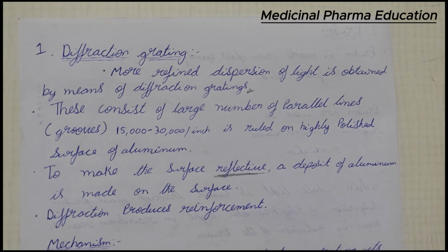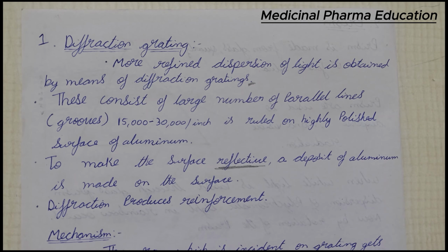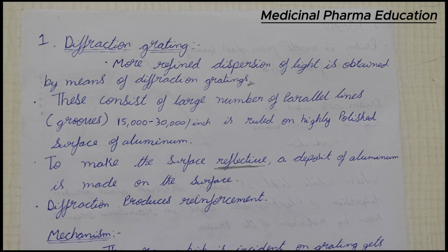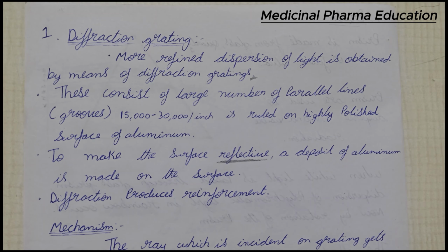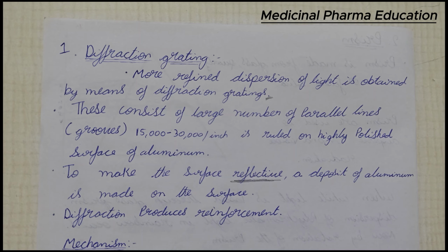And guys, the main point of giving you a lot of information is that in the master's exam they won't directly ask about the instrumentation. They will ask, explain the monochromators or explain the detectors used in the UV instrumentation. Rather than explaining all the instrumentation, they will ask about a particular instrument, so I'm explaining in detail and giving all the information required so that you need not refer to other books. That's why this video is becoming a little bit lengthy.